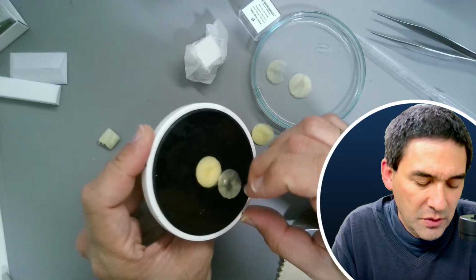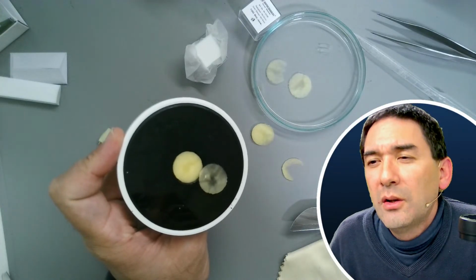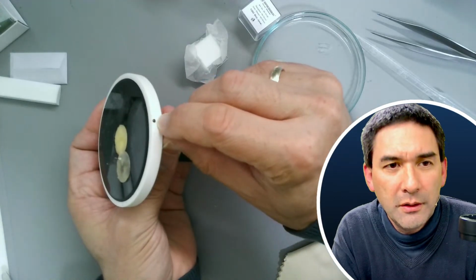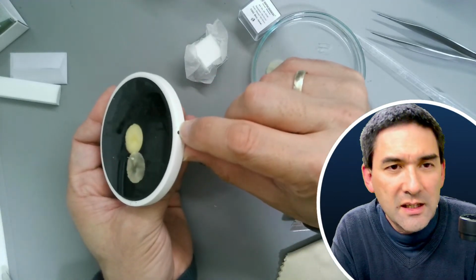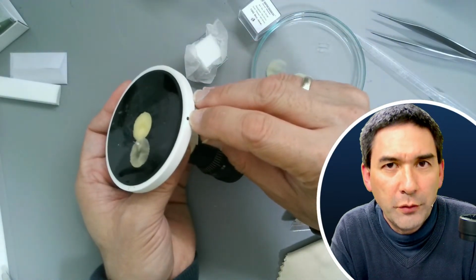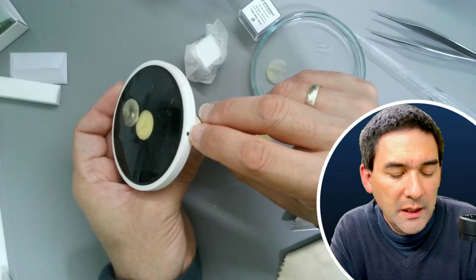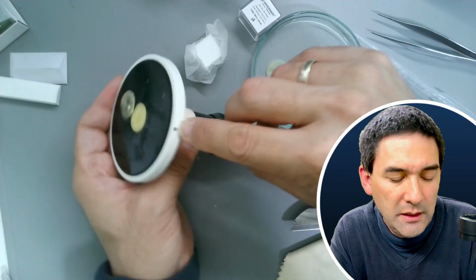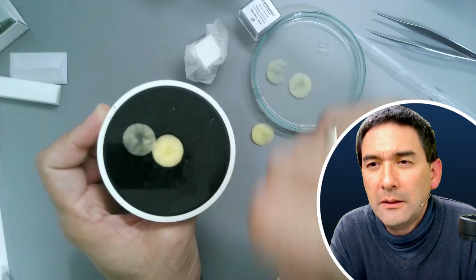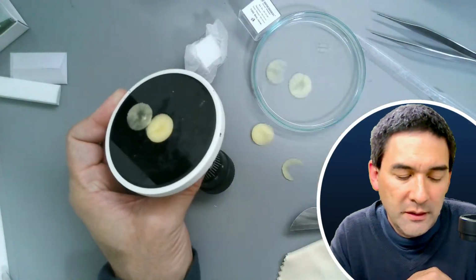Okay. So it could be maybe the holes in the piston. And what is the hole on the side for? Which hole on the side? Maybe, are you talking about this one over here? This hole on the side, I think, is a small screw that actually holds the black plate in place. There's one over here, one over here, and one over here. And there's a wrench. I think you can go in here, and this will actually hold the black plate. So unfortunately, it's not for holding the specimen itself.